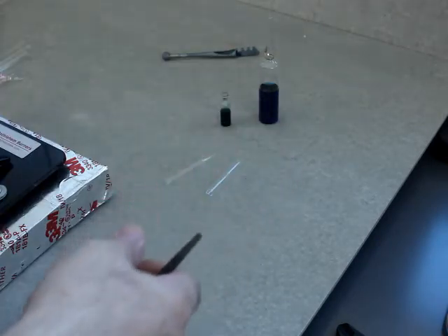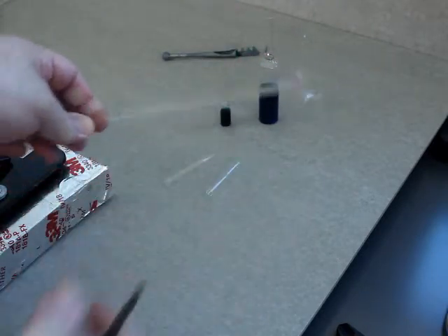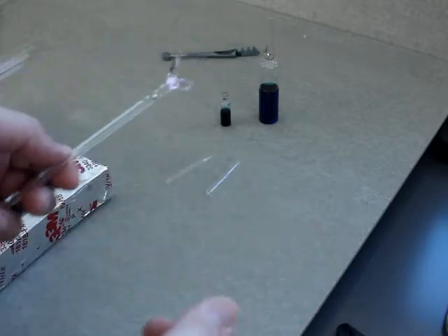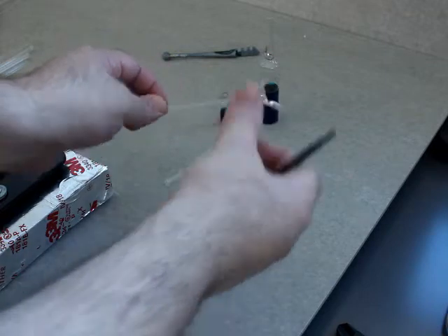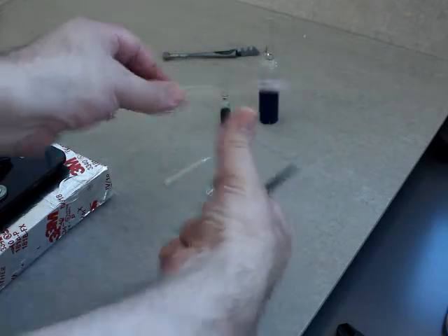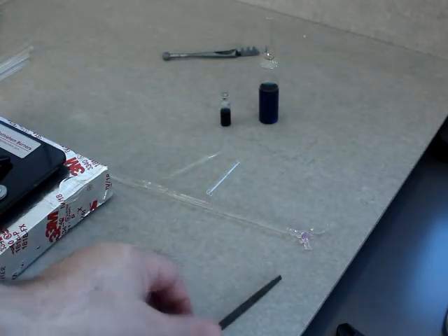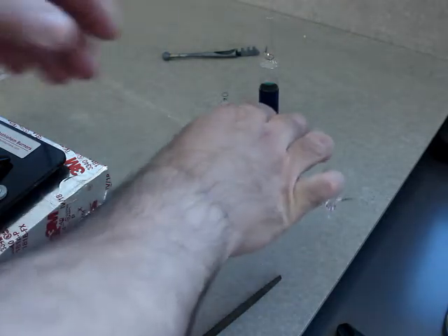What I mean by disastrous is: if you take a piece of glass rod or tubing and you break it incorrectly, when it breaks it will break randomly. It defies science, but almost like a magnet, some shard of glass will find a way to go into your hand, into your thumb. Statistically, the odds of you cutting yourself is close to 100%, which just shows again how finicky glass can be if you don't treat it correctly.